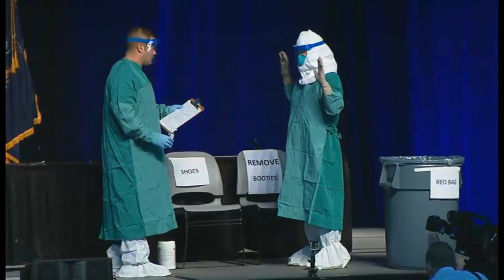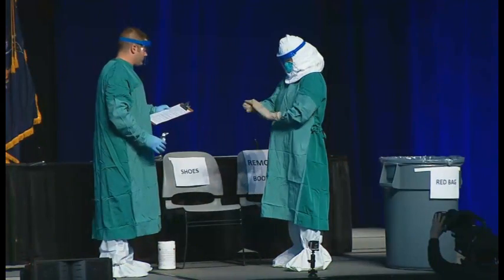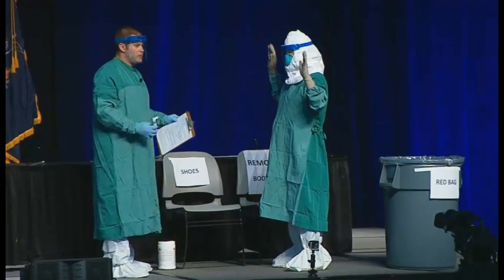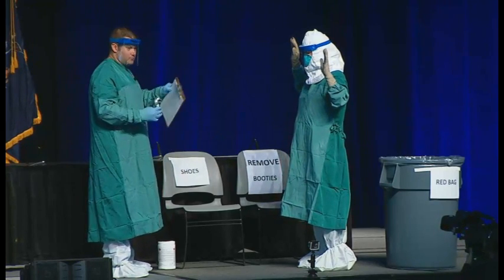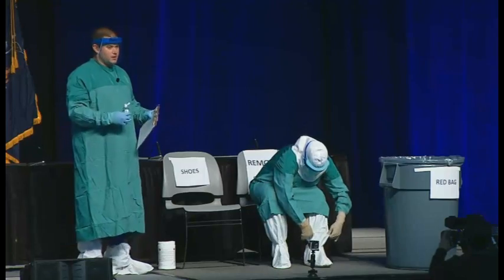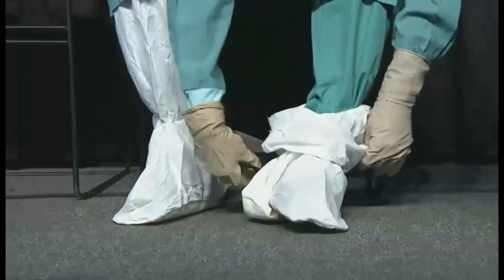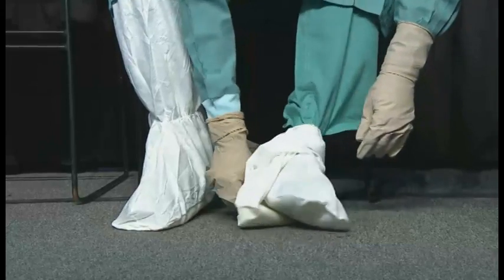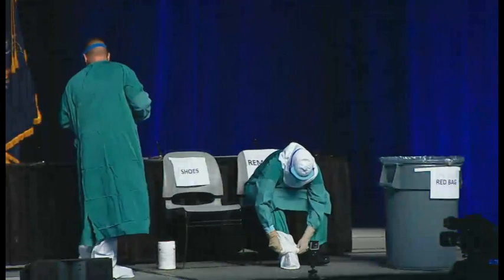First, we're going to disinfect her outer gloved hands, and we're going to do this after each step. We have two chairs here — she's contaminated now, so she's first going to use the remove-booties chair. Barbara is going to sit down and carefully remove the shoe covers — everything when you remove should be very slow and deliberate so as not to risk any exposure. We have a trash can readily accessible in this area where we're removing the PPE.